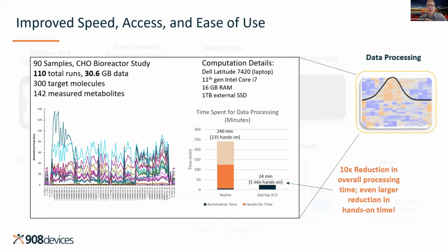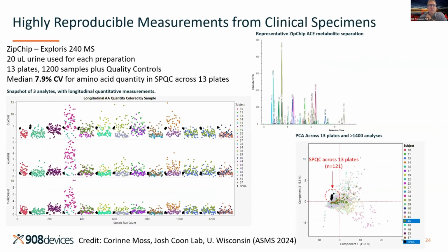It took me about 4 hours to get through this, with most of that being hands-on time for doing the curation. With the automated process, we feel like we can generate a 10x improvement in the overall processing time, which is what we expect to be able to do with incorporating the isotopes, the index alignment, and the automated algorithm approach.